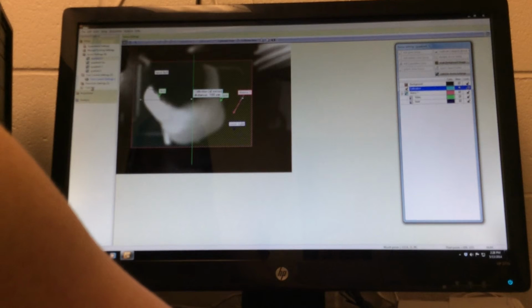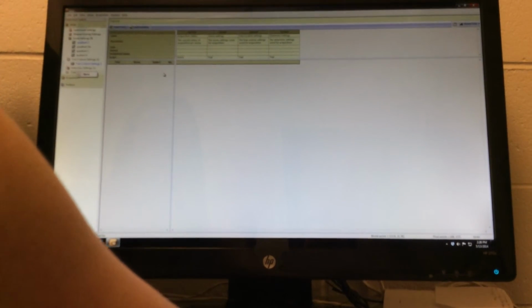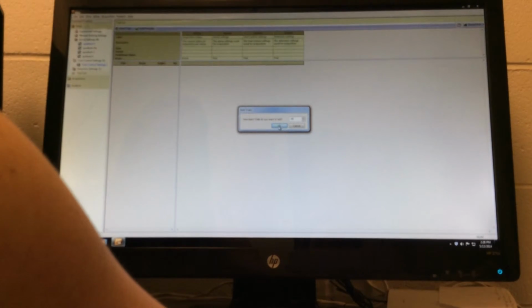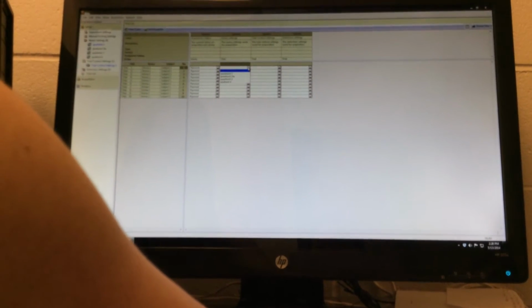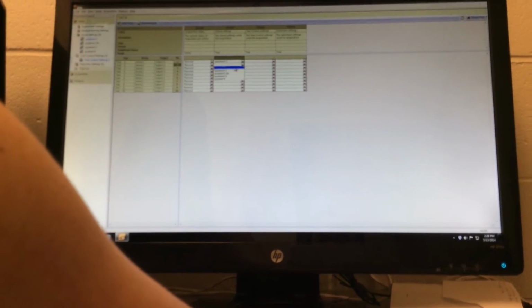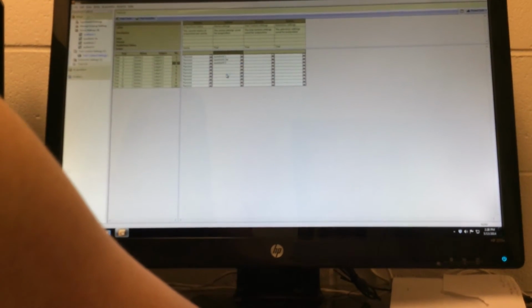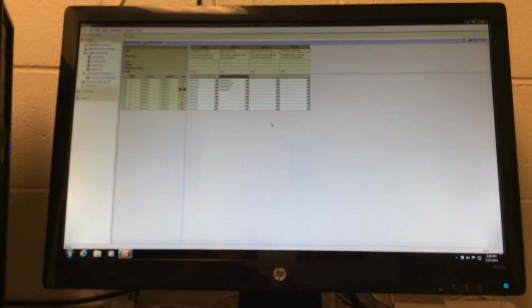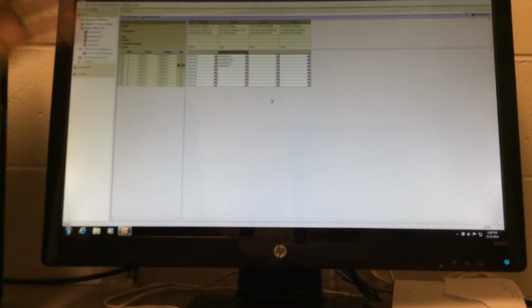And what's really nice is that here in the trial list, if I know, let's say, we're going to do 10 animals today, then I can designate that for animal 1, I want to use this one. So you can already tell it, and now the software knows which one it's supposed to use for each of your trials. Okay. So you can prep all of this ahead of time.